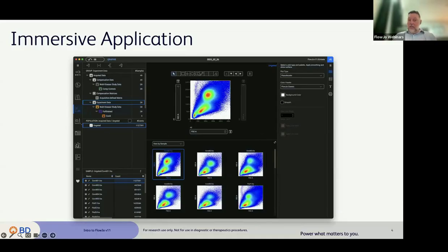So yes, this is kind of a walk through the area of the program. This is your contextual menu with groups and samples, and the gates will build up right here in the middle when we start drawing them. You've got your X and Y choices. You can click the T button to go to your transformation tools, which will be over here on the right. You can click the XY to control the XY parameter settings, and now in V10 or V11.1, we have high resolution graphics you can choose from.